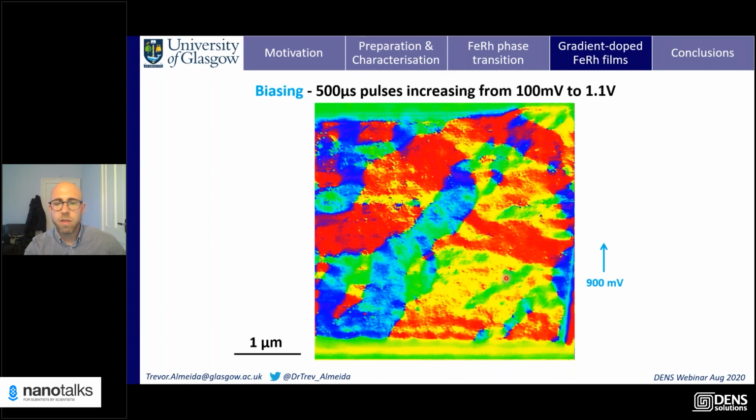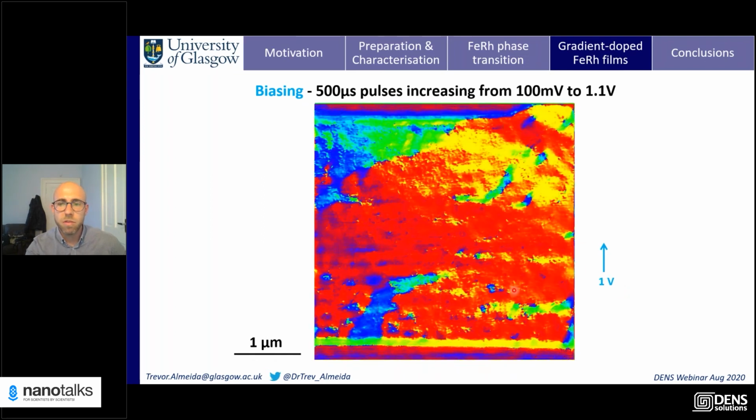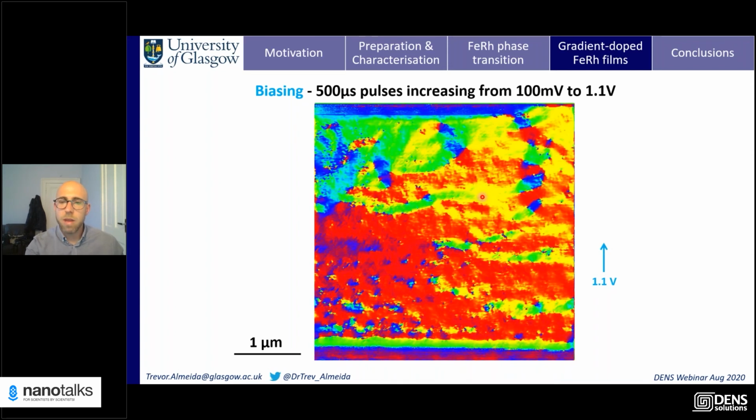So here we can see these domain walls or domains becoming more perpendicular to the direction of the current pulses. And this continues up until a state where they become either annihilated when they're parallel to the current pulse direction, or in this case, this one's probably pinned. And we keep on applying current pulses to a state where they tend to be perpendicular to the current pulse direction.